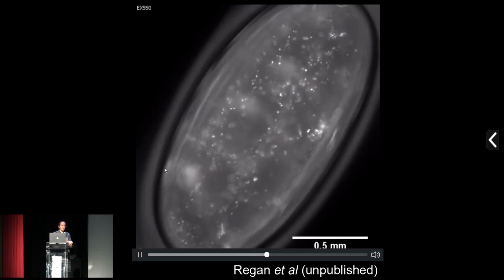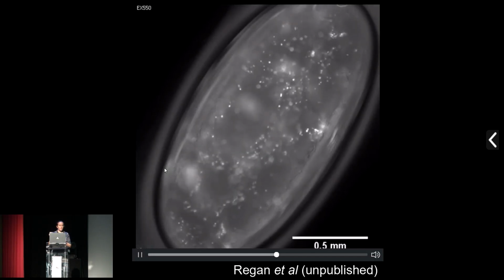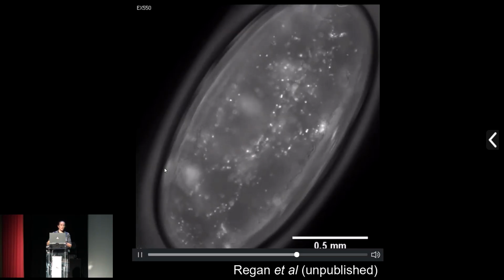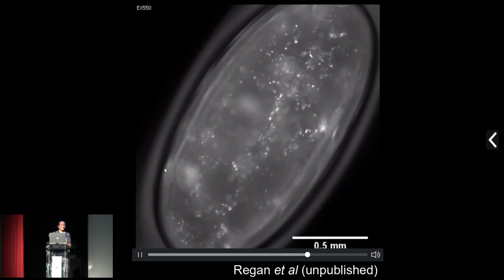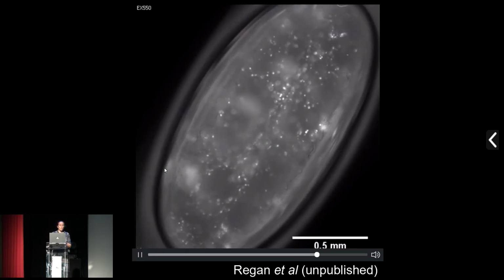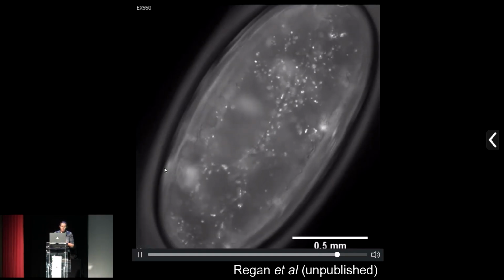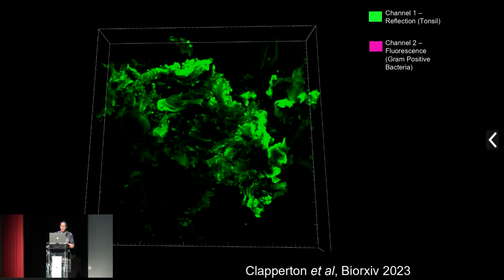Now, the advantage here is that the green fluorescent protein in these hemocytes is so low, but the collection efficiency of the Mesolens is about 20 times higher than any objective lens, so we can use this for still quite high contrast imaging. So the researcher was delighted, and therefore we were pleased.